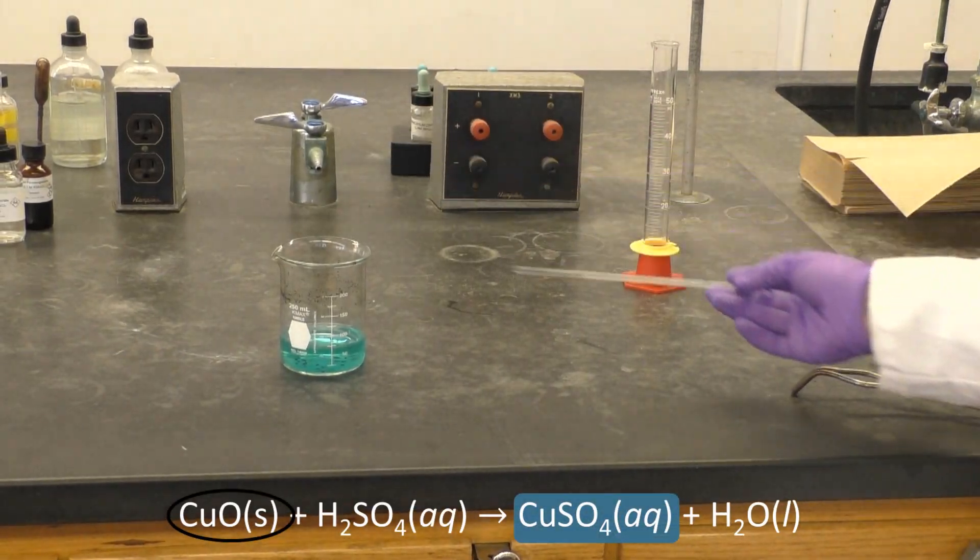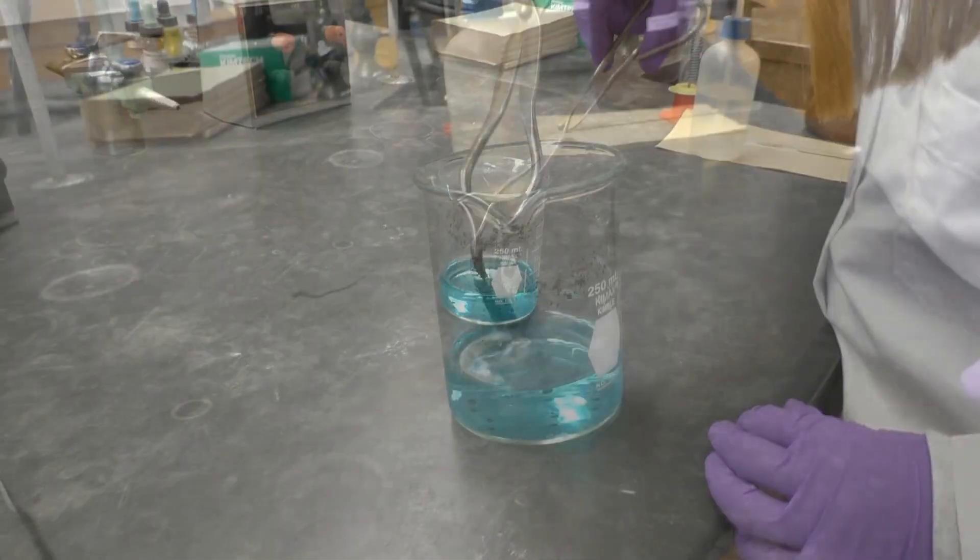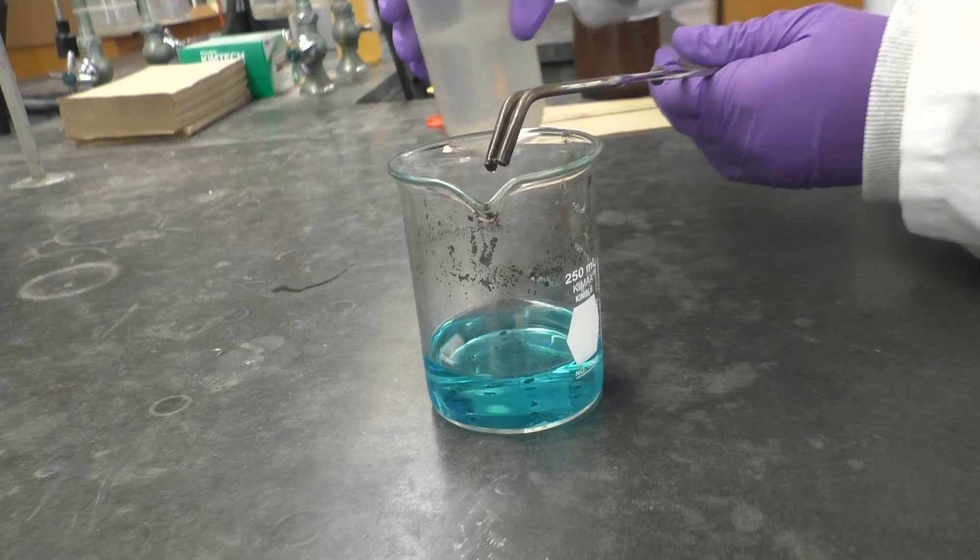The resulting blue solution indicates that you made the desired product. It should now be easy to pick out your boiling chips with tongs and just throw them in the trash.